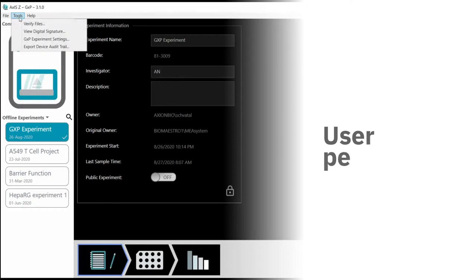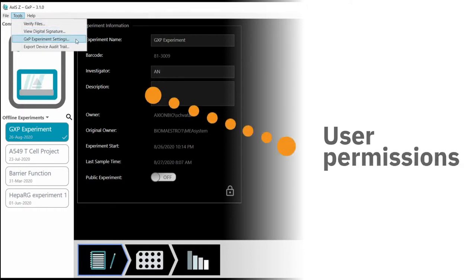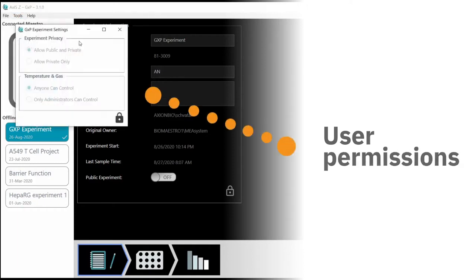The Maestro Z's software user permissions allow administrators to control who in your team can make changes to experiment settings.